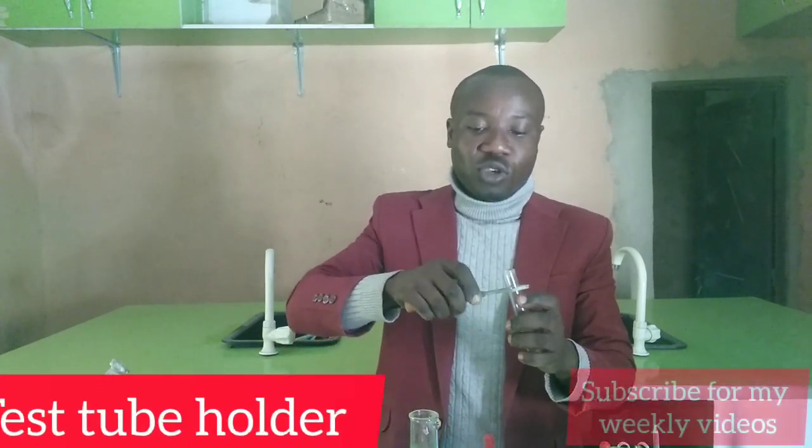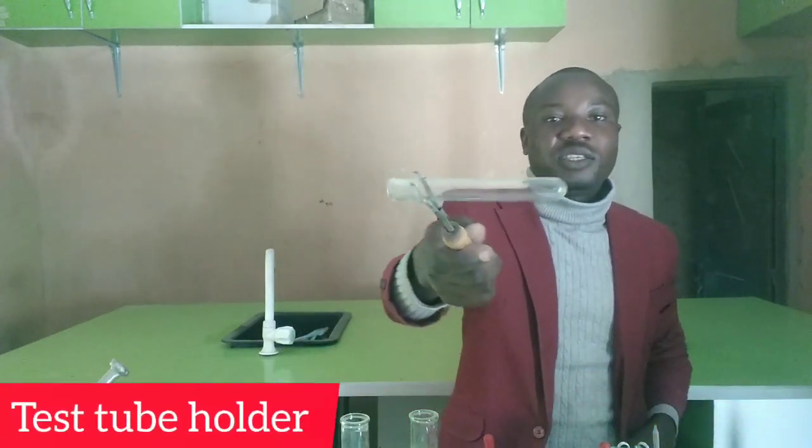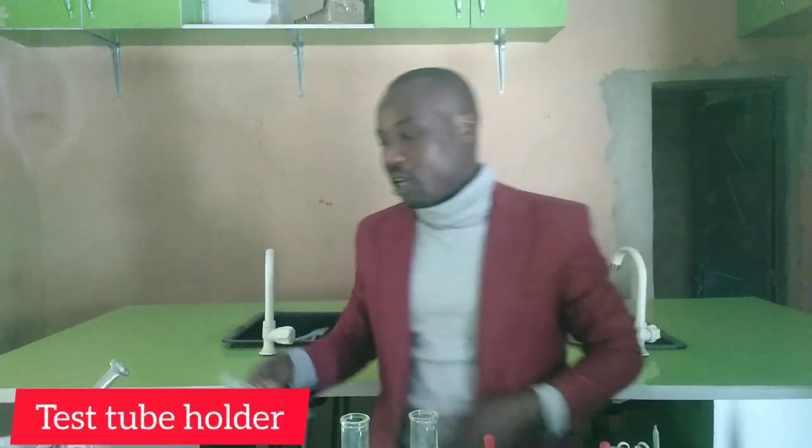Now this is what we'll do. We'll use it to hold it like this. You can see, yes, now I can do my heating. So this is what we call test tube holder.